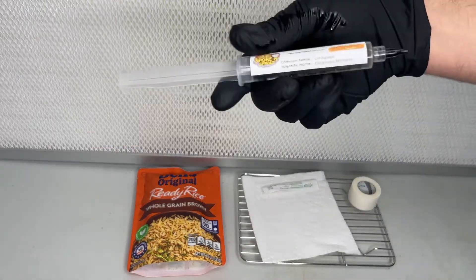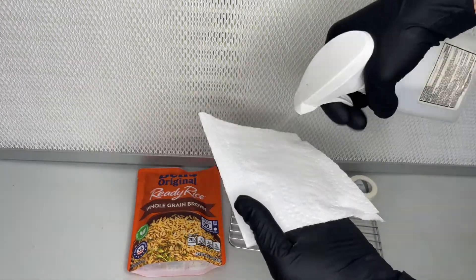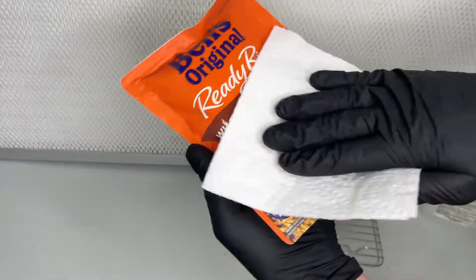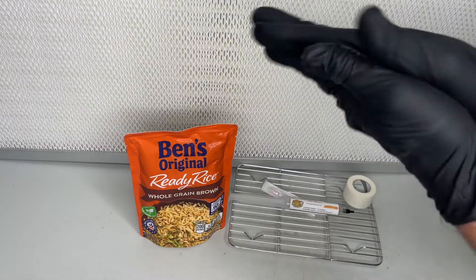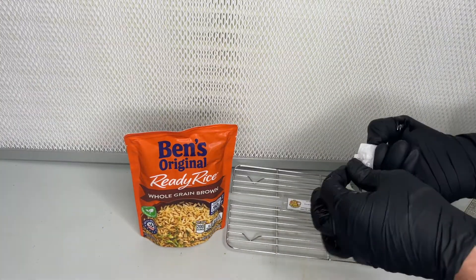The rice comes pre-cooked and sterilized, so the only thing you have to do is inoculate it with 10 milliliters of Cordyceps Militaris liquid culture. For the first step, I use isopropyl alcohol to wipe everything down, as we're trying to be as clean as possible.